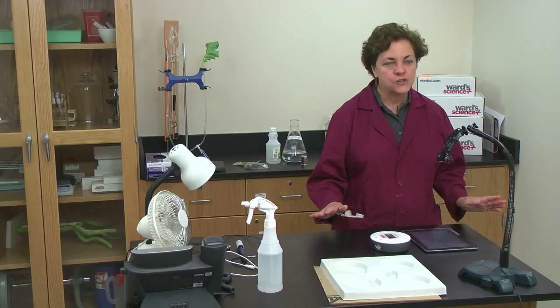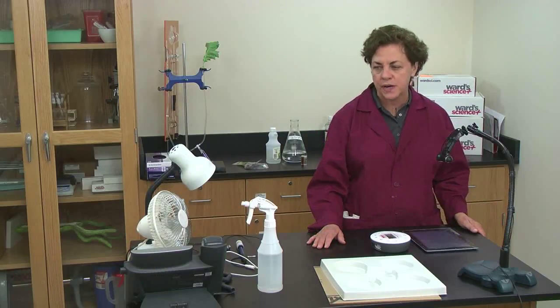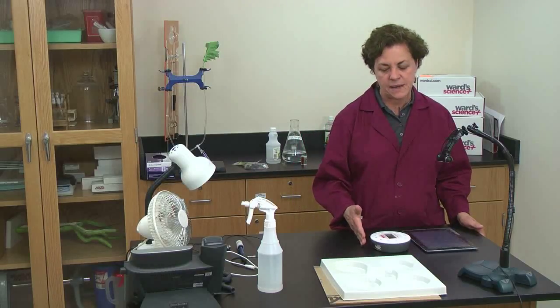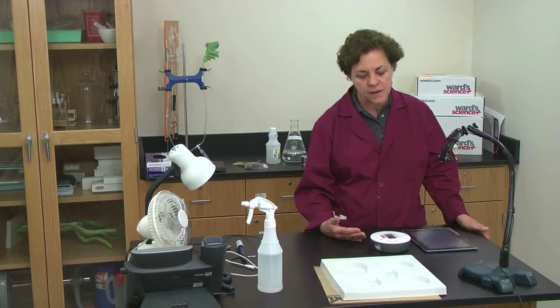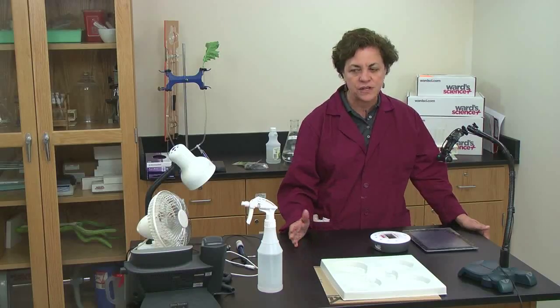The first of these experiments that I want to talk about is transpiration. I skipped the beginning for now as far as labs 1 through 10. Some of them pair very easily with the Datahub. Other ones are a little harder, which I'm sure you can understand.